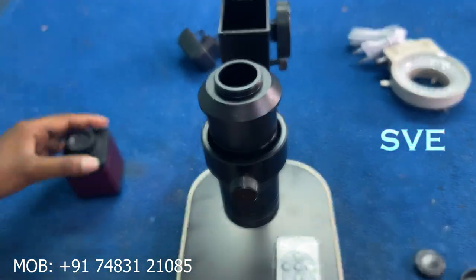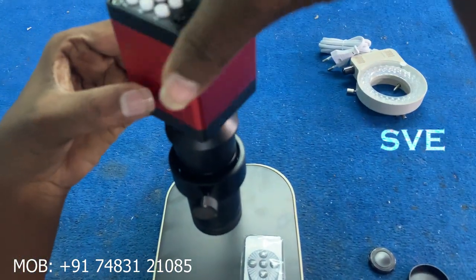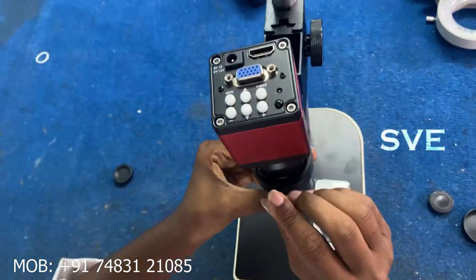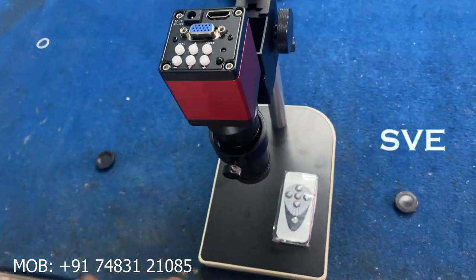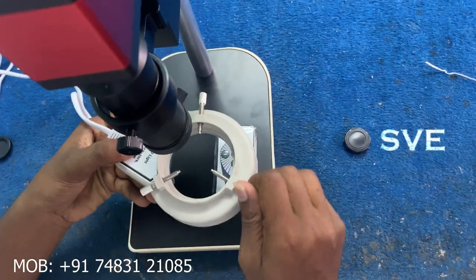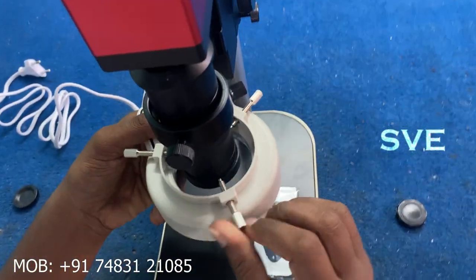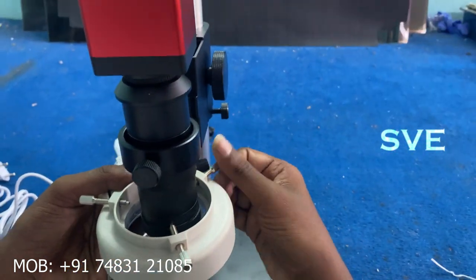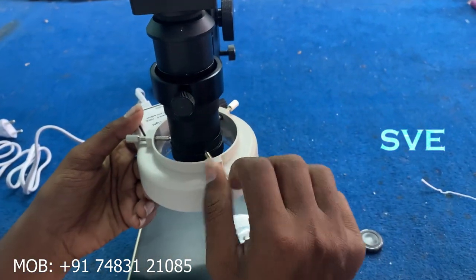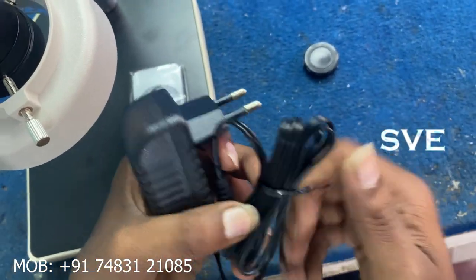Next I am going to fix this microscope here. Let's fix the camera. Next, here is our LED light. Let's fix this light here. Next, this is the microscope adapter.